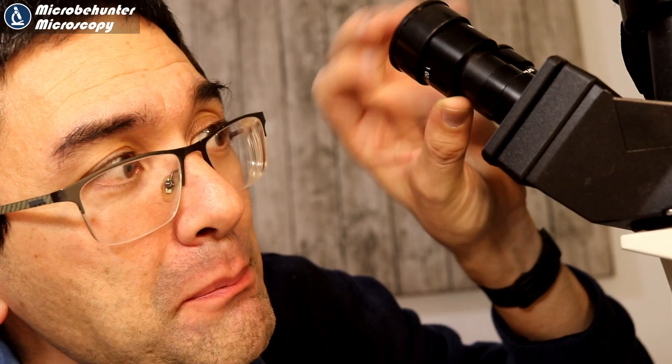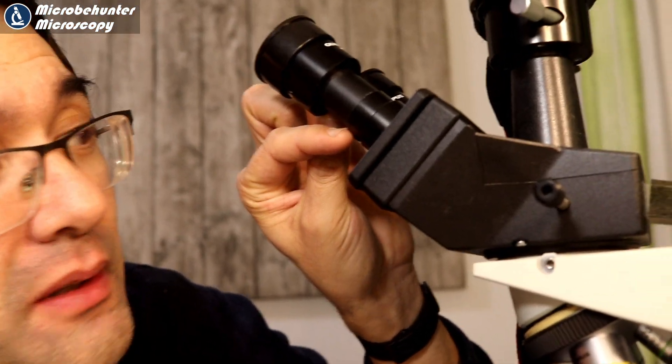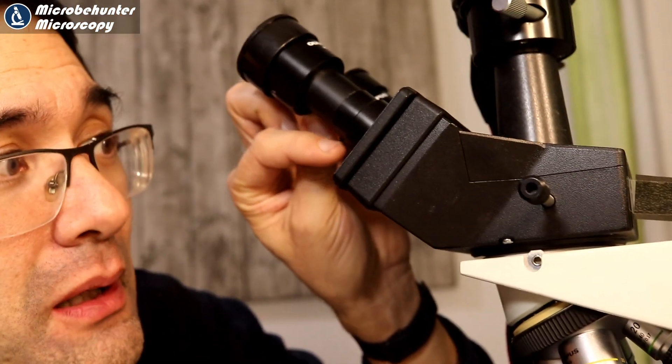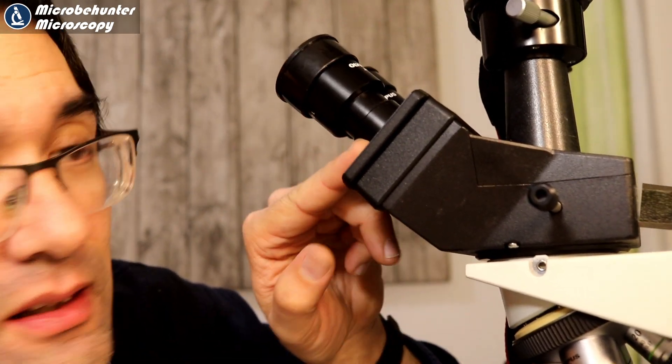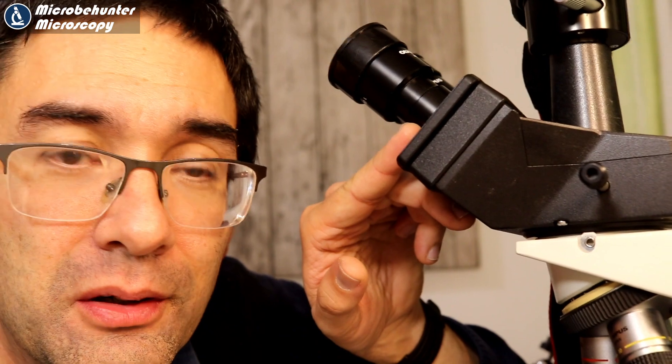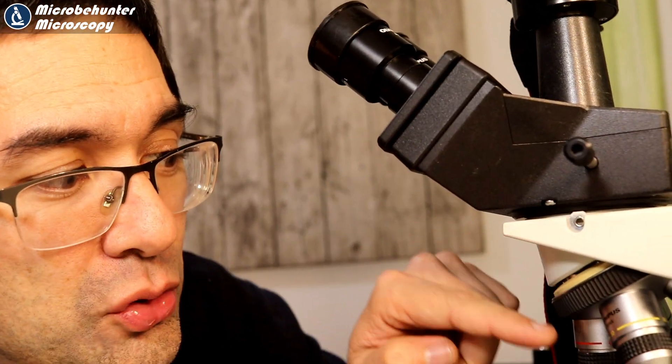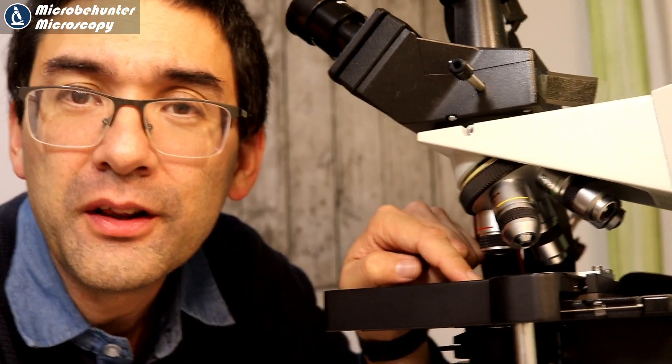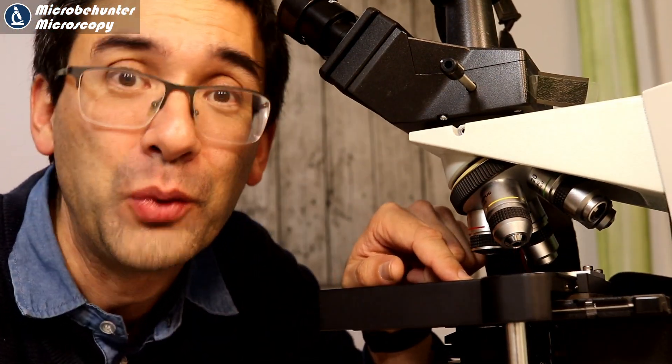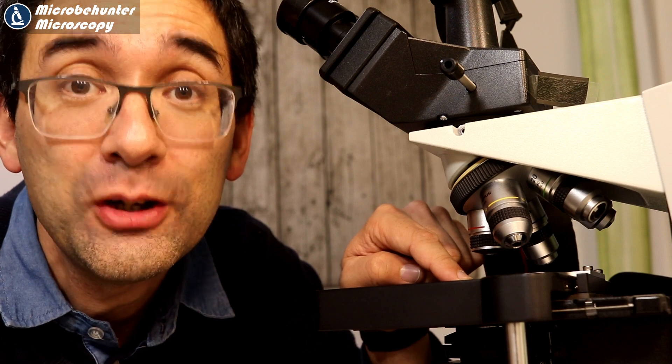We're not talking about the place where the eyepiece rests here, but the image is projected around 10 millimeters down into the tube. This distance, 10 millimeters down into the tube here, all the way down to the object, this is the conjugate distance. There are two versions: 185 and 195, as I already mentioned.